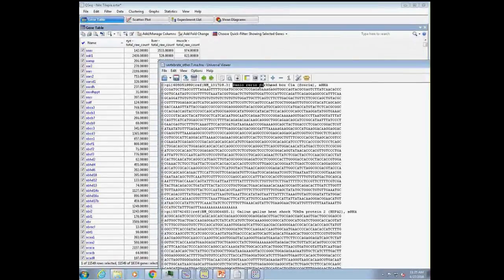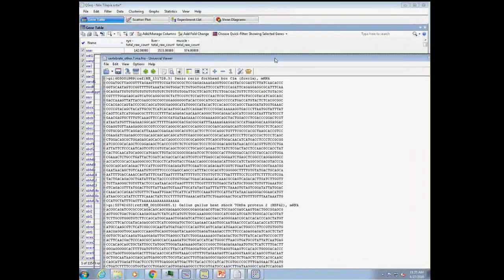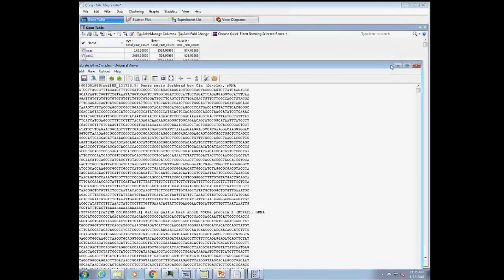So we have these species names and descriptions that are hard to drag through just because they aren't quite standard enough. But we have a way to import them into RNA-Seq, and it uses a kind of a custom import wizard that allows it to parse information. And so this information was put into our all transcripts table.